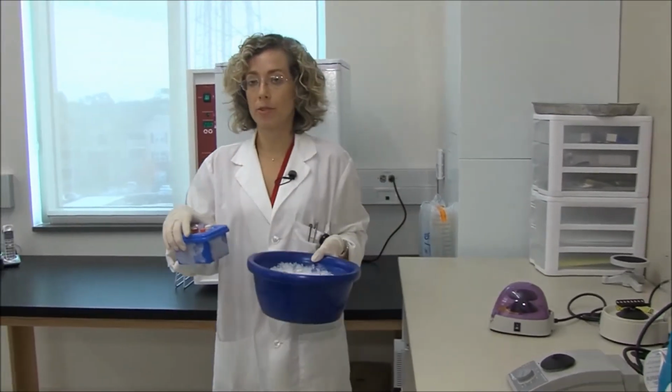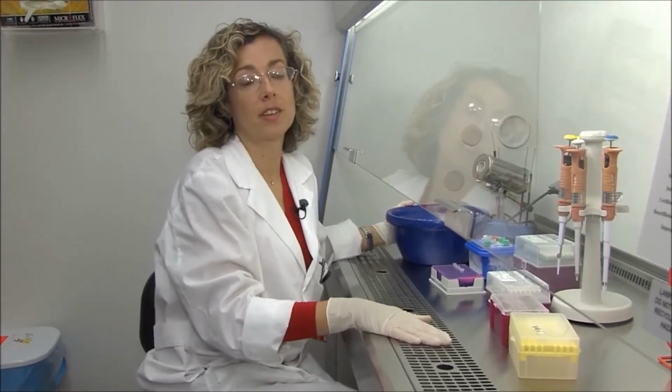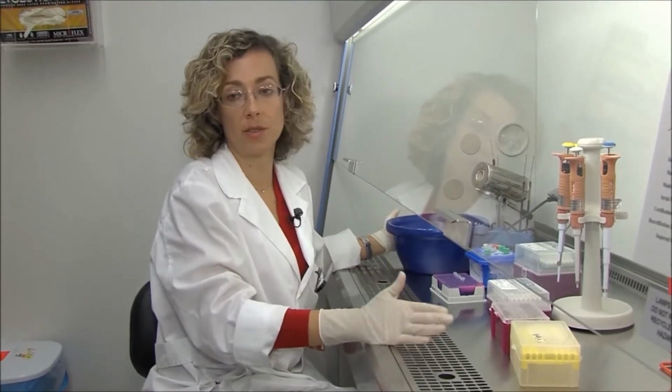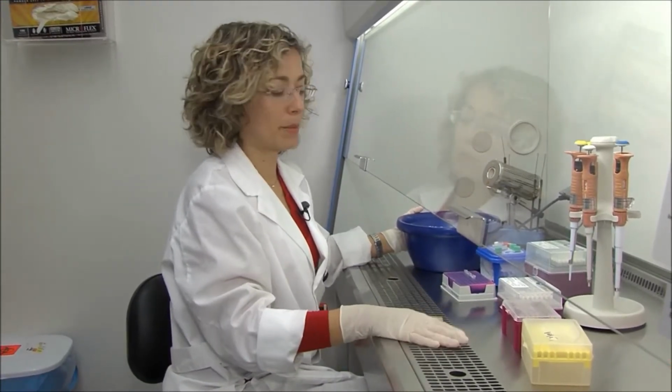So we are now ready to set up our PCR reaction. So we are going to set up our PCR reaction and we are going to prepare our own master mix. You can also buy a commercial master mix, in which case you just have to dilute the master mix. But today we are going to use all the ingredients that make the master mix.